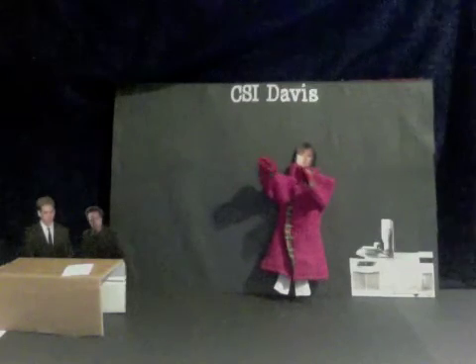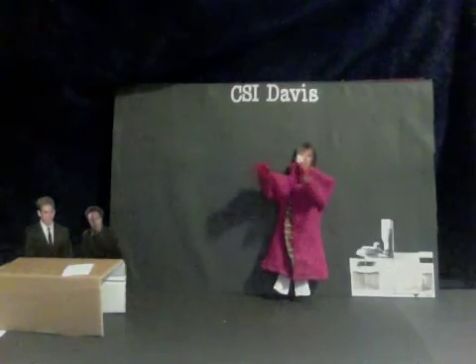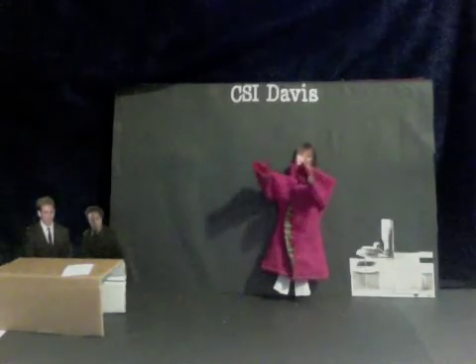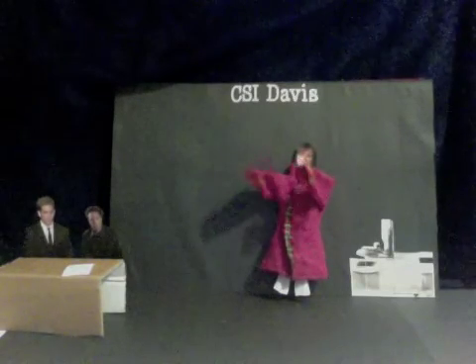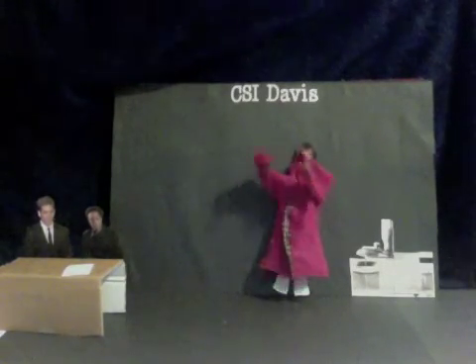Looking at the results, I can obviously tell that the GCMS for the date portion of the work order is completely different than the results for the rest of the document, which means that Harper used different ink to sign in the date. This work order has been compromised.